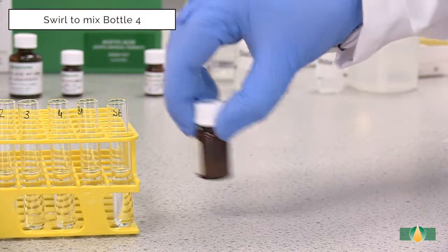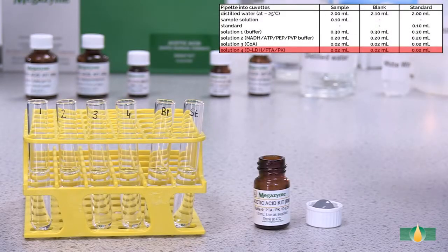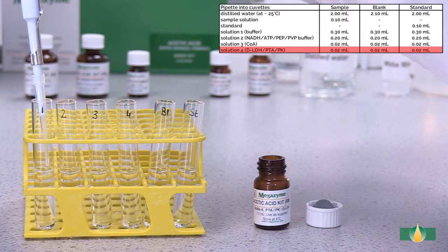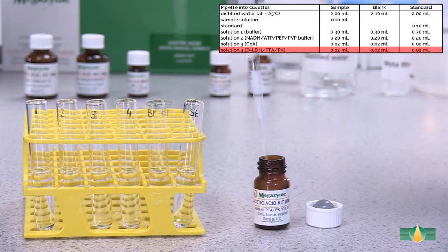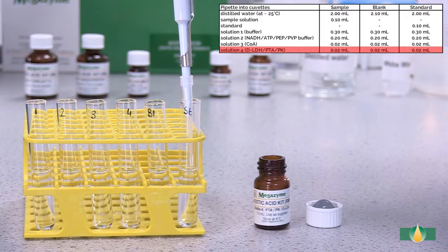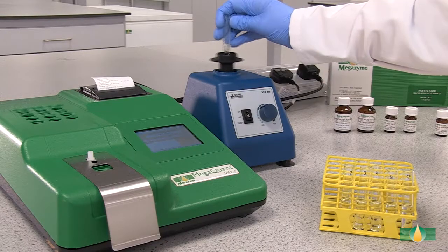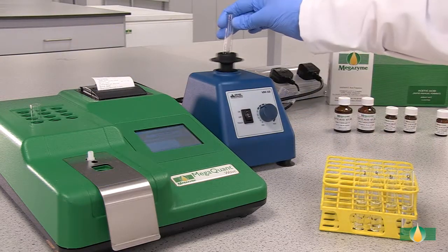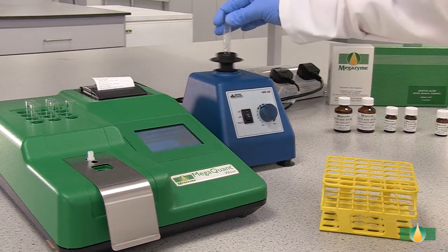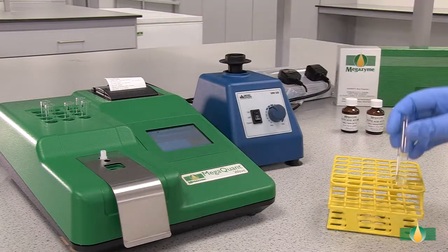Swirl to mix the contents of bottle 4 prior to dispensing. Pipette 20 microliters of suspension 4 into all assay tubes. When all of the components have been added, mix the tube contents thoroughly and incubate the tubes in the 37 degrees Celsius heating block for approximately 2 minutes. After 2 minutes, record the first absorbance reading A1 at 340 nanometers for all of the assay tubes.